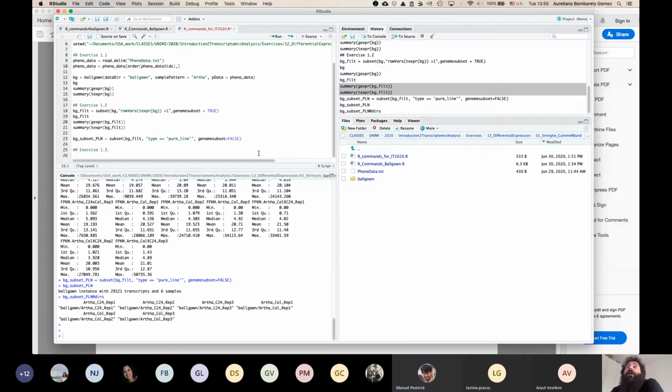Well, indeed, it changes depending on the person that is running the analysis. I use 1 FPKM because it's what appears in one of the tutorials. I think that makes sense. But of course, to be completely sincere, you will need to go and check your distribution. Also because maybe your experimental design is done in a way that you want to analyze low expressed transcripts too.